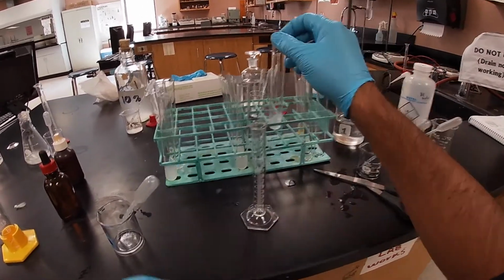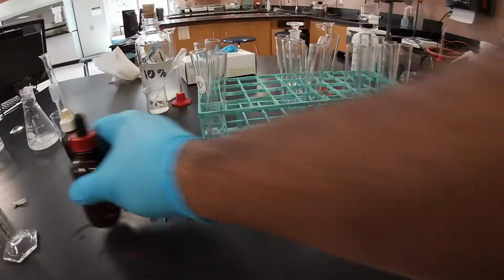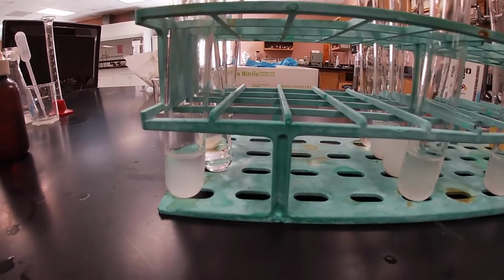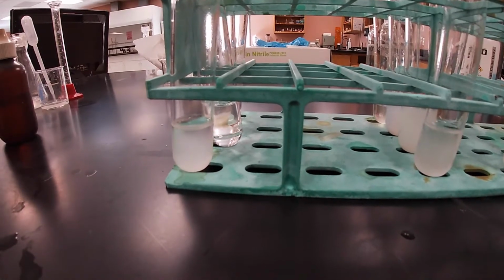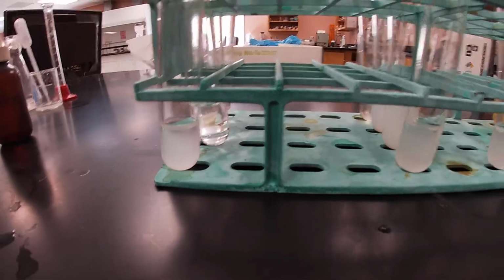And there we go. All right, so we're going to do the following test. Again, we're going to conduct our test. Let's go ahead and move my Benedict solution over here. My standard. Actually, no, let's go ahead. My standard, my Benedict solution beaker.